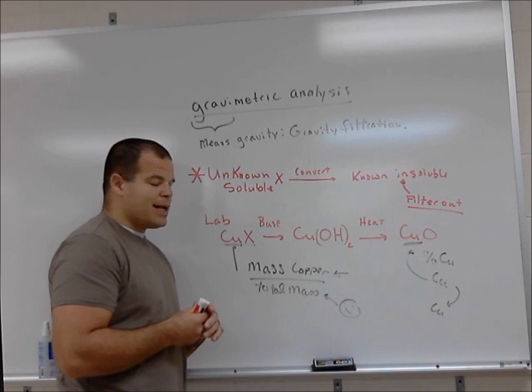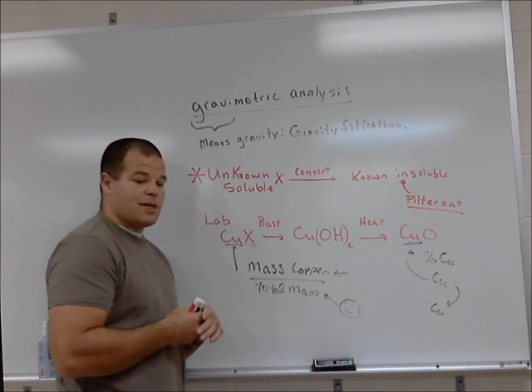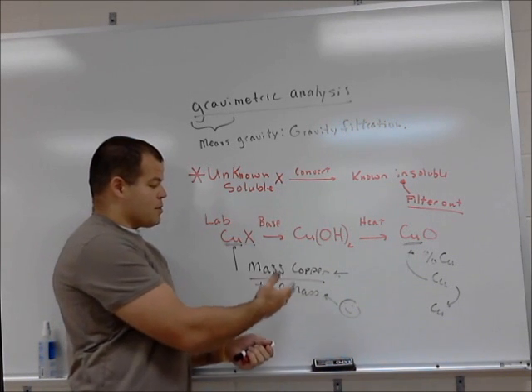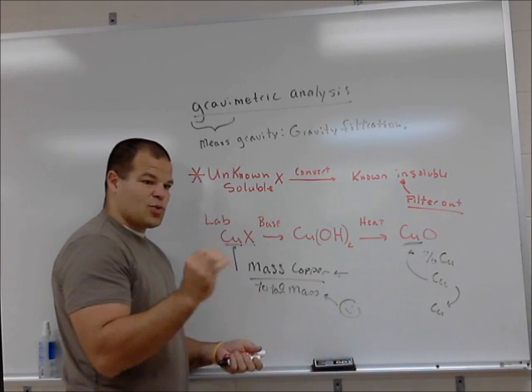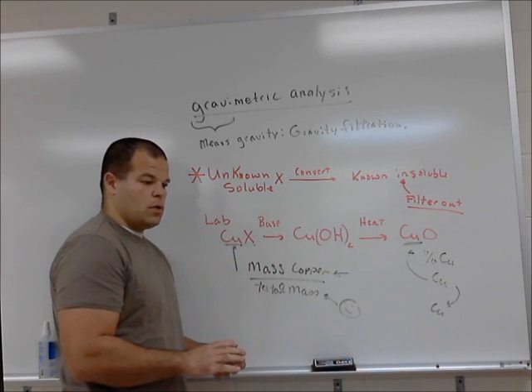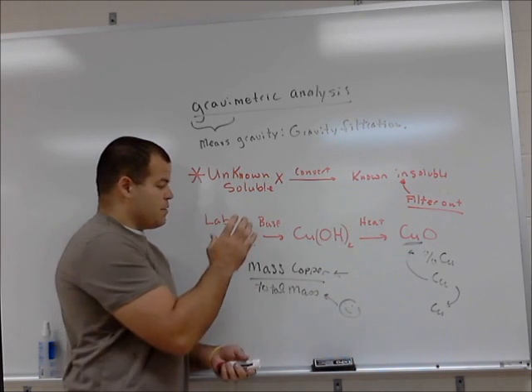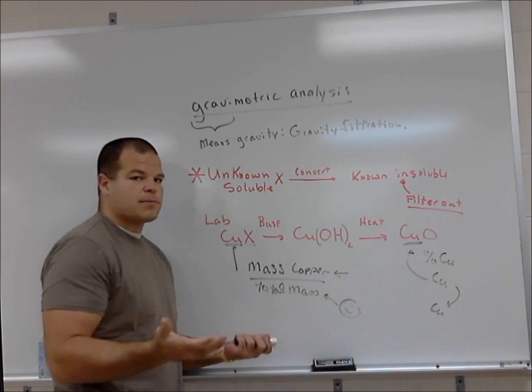It has a lot of uses. Basically, we can figure out an unknown substance. For this particular lab, we are calculating the percent composition of copper in this compound. Then the actual identity of the chemical will be identified based on comparing this mass percent copper of this unknown compound to a list of possible knowns.